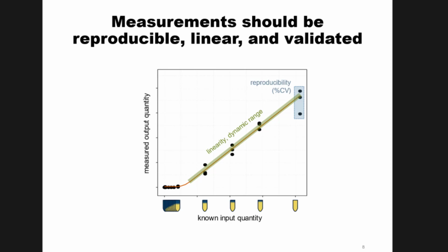Matrix is super, super important. The matrix must be as similar to your sample matrix as possible. Identical would be best. So if you're using some types of calibration curve, you would have endogenous peptide in here too. Your light would be in here as well. So there are ways you can do it in reverse.